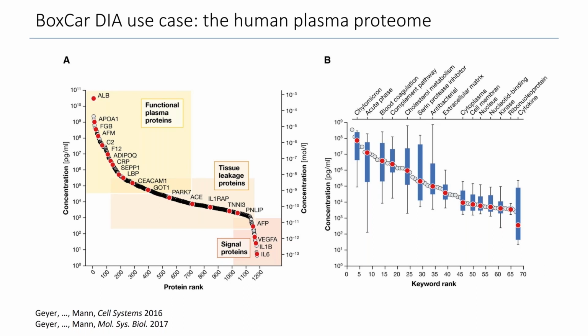They have actually not been studied in great detail. So we think that this is actually a very interesting area to look for biomarkers, and we've been pushing the technology to go that far.